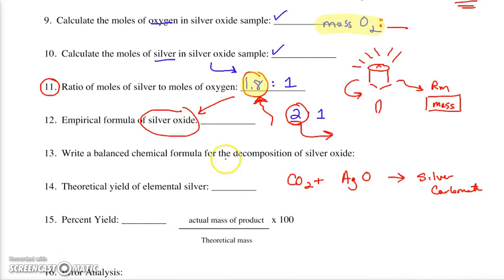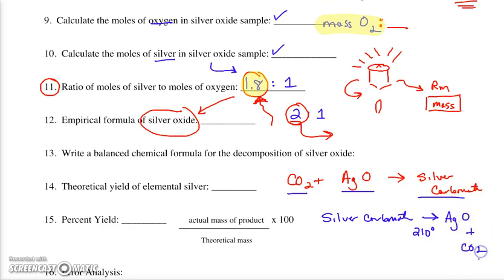Now, honestly, when they use this to scrub the CO2, that means the silver oxide, and by the way, they do this in nuclear submarines mostly. Silver oxide takes the CO2 out of the air to make silver carbonate. What they can do is take the silver carbonate and heat it, at around 210 degrees Celsius. If you heat it beyond that, you can reclaim your silver oxide. Again, I'm writing AgO as my empirical formula. It may or may not be right, wink, wink, plus the CO2, and you can restart this.